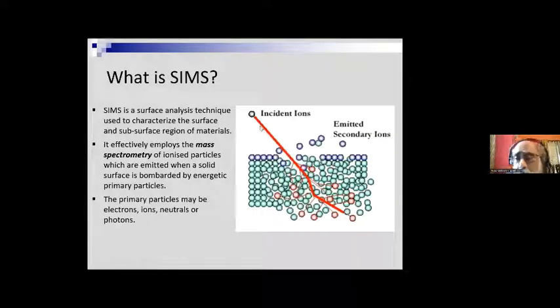Now, when the ion beam is incident on the material, you can imagine a single ion can go inside the material, and these are the atomic layers. The single ion can make collisions with the target atoms, and you can have a primary collision, and the primary collisions can initiate secondary collisions, and so on and so on. So you can basically have lots of collisions. So you can have a collision cascade.